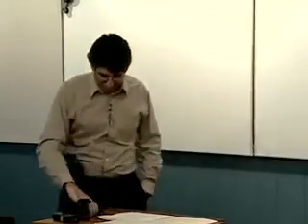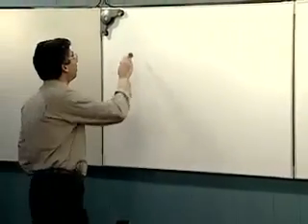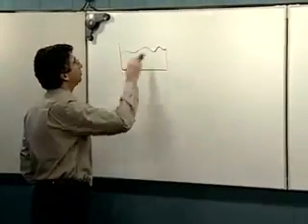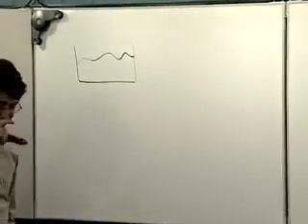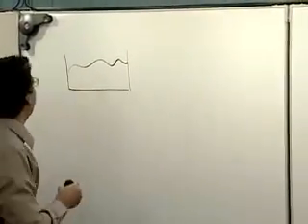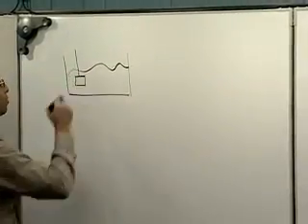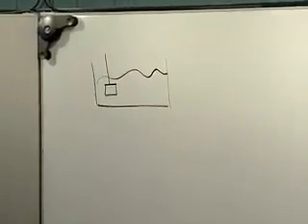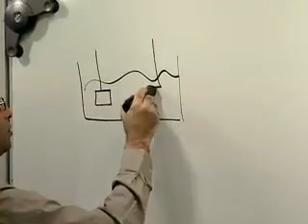Okay. So what you might do, let's see, is, oh, you need a beaker also and some electrolyte. We'll give you that also. So you have some salt water here in a beaker. And you have a sheet of platinum. And so what you might do is cut 2 electrodes out of the platinum. Maybe one looks like that. And you're not too careful about this because you're locked in a closet. And so the other one looks like this, maybe.